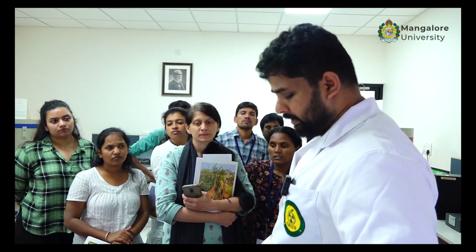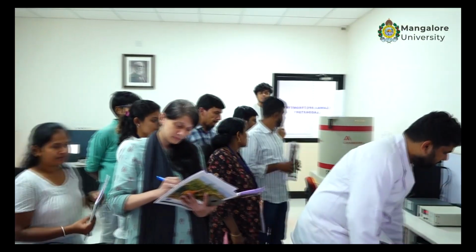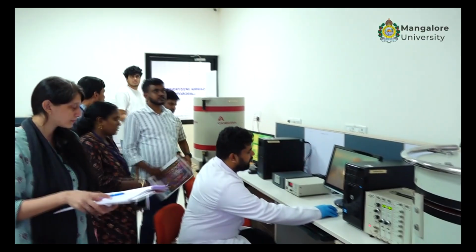That's all about it. So I'll just show you a spectra before starting with the counting of the sample.